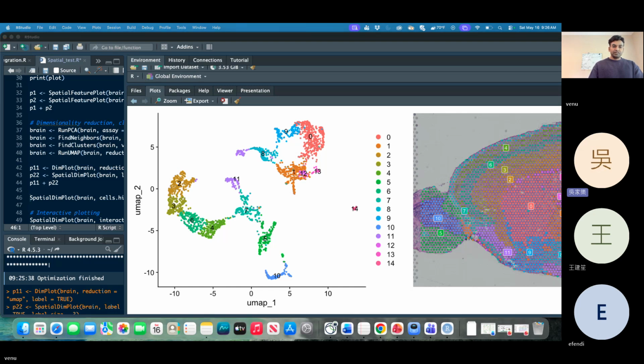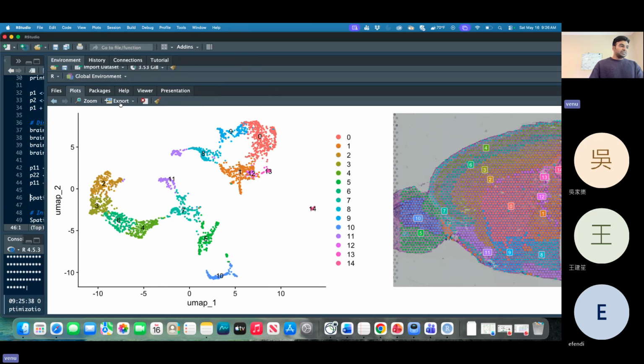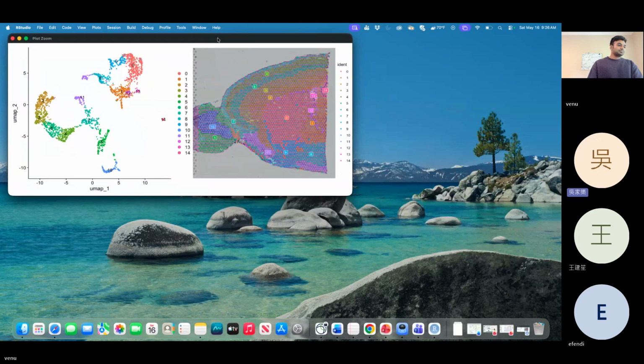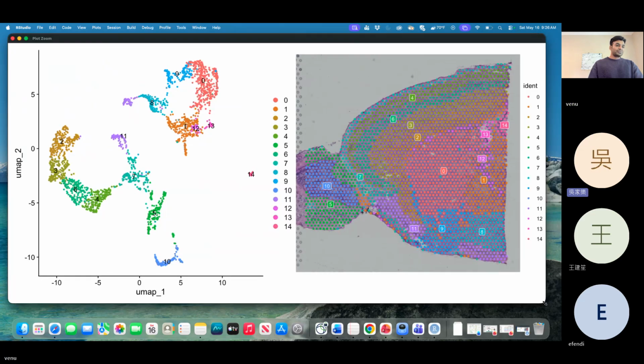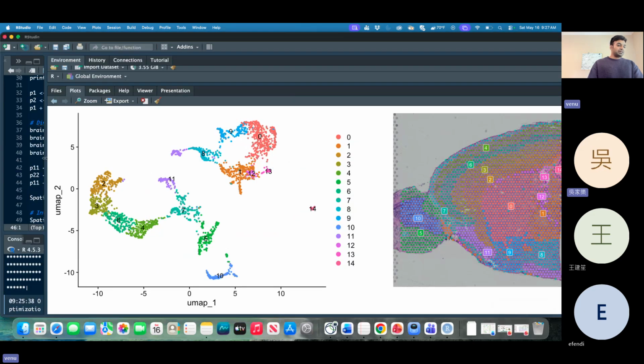So the image on the right-hand side, is it typically composed of 5,000 spots? It is right now. It may not have 5,000 spots, but typical big images have 5,000 spots. Each little circle on the right image denotes one of the 5,000 spots. Is that right? Yes, yes, yes.